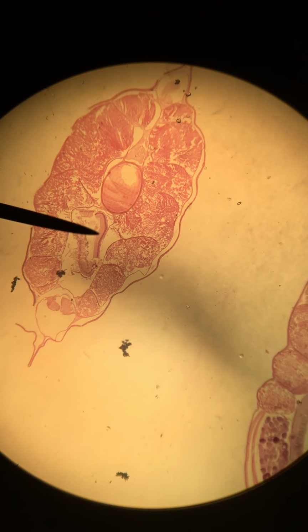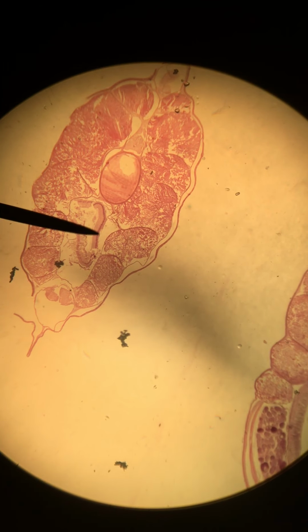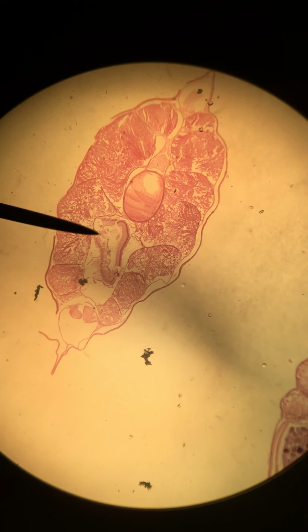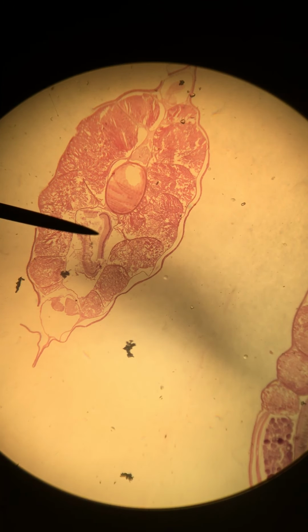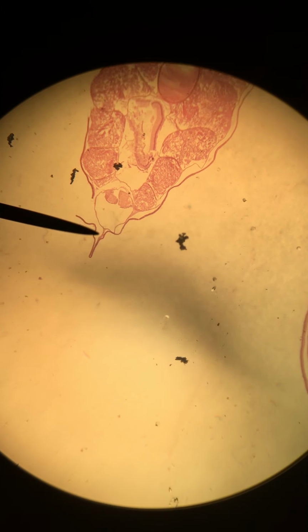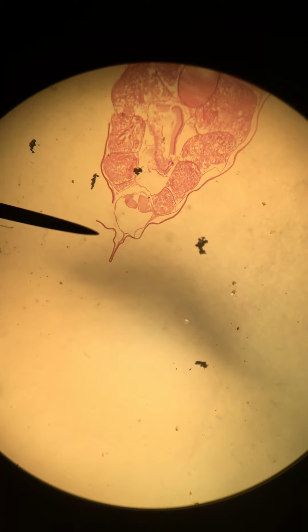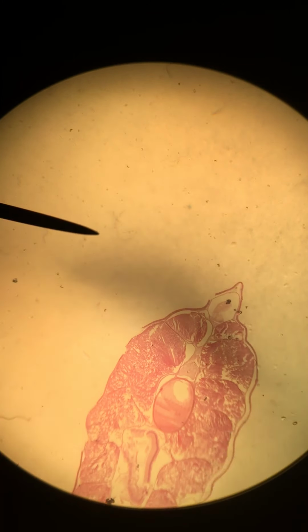So this is of course digestive function, processing of food. This is the intestine. It's gotten a little fragmented here just in processing of the slide, but it would be a tube, of course. And we can start to see our ventral fin forming here as well. So there's the ventral fin, the dorsal fin, and then I think there's one more.